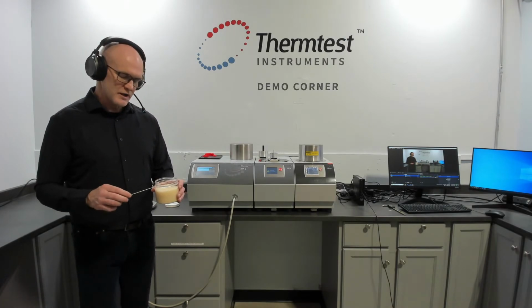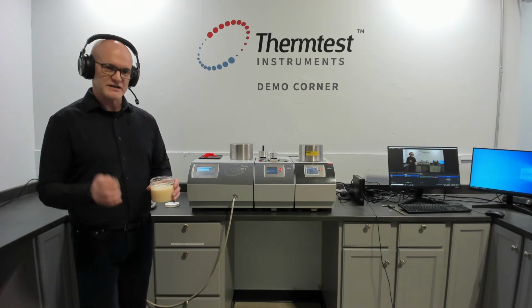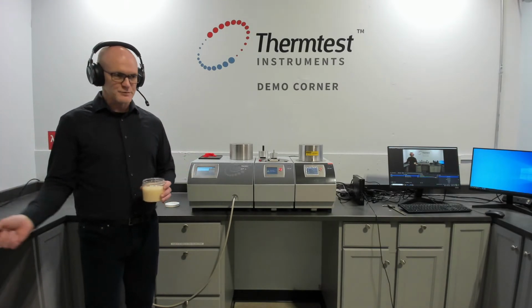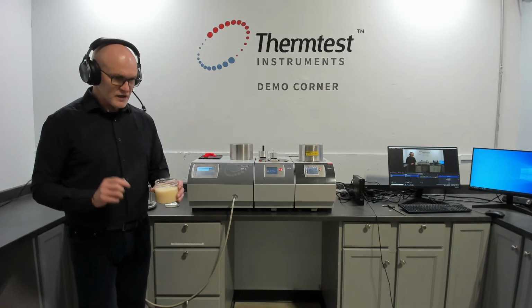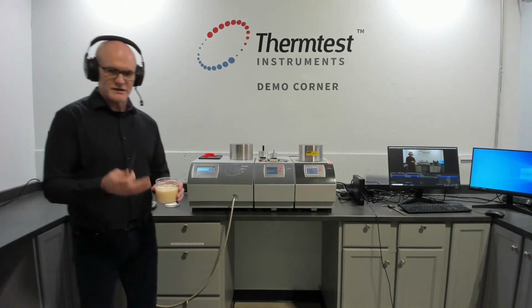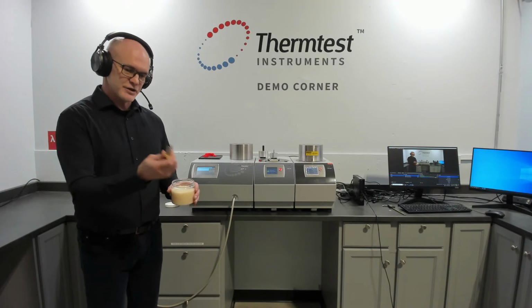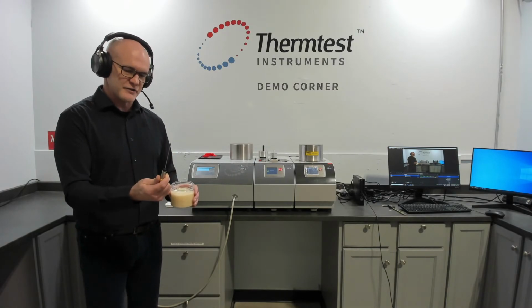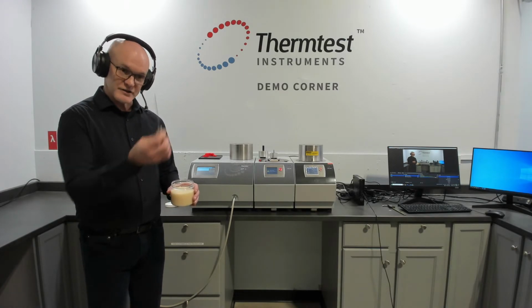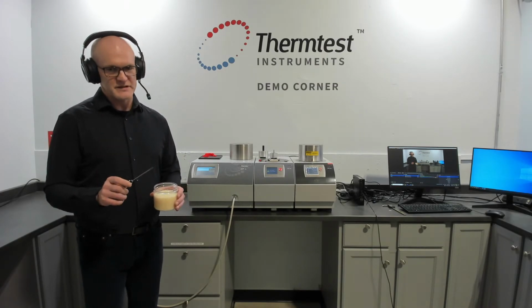So over a year, we developed a polymer melt cell specifically designed for the transient plane source, which is available in the MP-1, as well as the MPV and the MP-2. The added advantage of that method, in addition to the solution we're providing for the 3 issues just mentioned, is that it measures multiple properties. When you're using a transient line source, ASTM 5930, your output is only thermal conductivity. When you're using transient plane source, the output is thermal conductivity, thermal diffusivity, and specific heat.